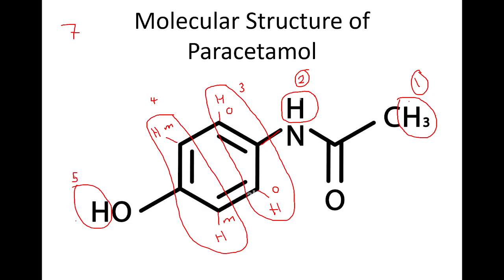So one of my questions, for 1 mark, I said, tell me how many NMR hydrogens are in paracetamol. How many different proton environments?